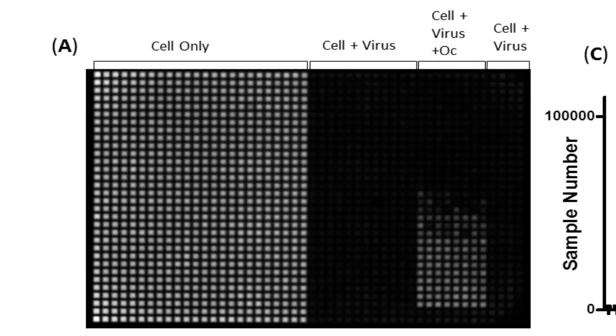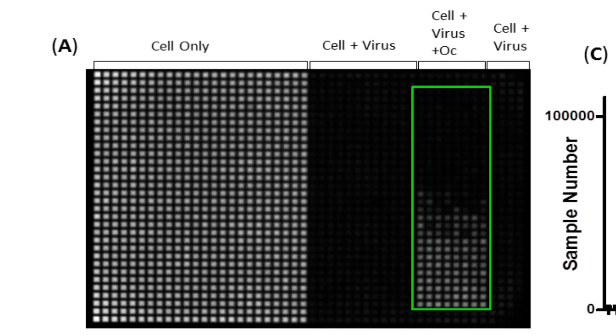And the next question is, how can we provide an assay that's predictable for finding unknown compounds, inhibitors for the antiviral? So again, here we have to use a control compound. Here we use Tamiflu, a known anti-influenza virus compound. We add different doses of Tamiflu to the wells. And as you can see from bottom to top, there's a gradient decrease in the protection from virus killing. When you have a high concentration of Tamiflu, there's better protection, as good as no virus infection. When you have less Tamiflu, the protection gets less effective.